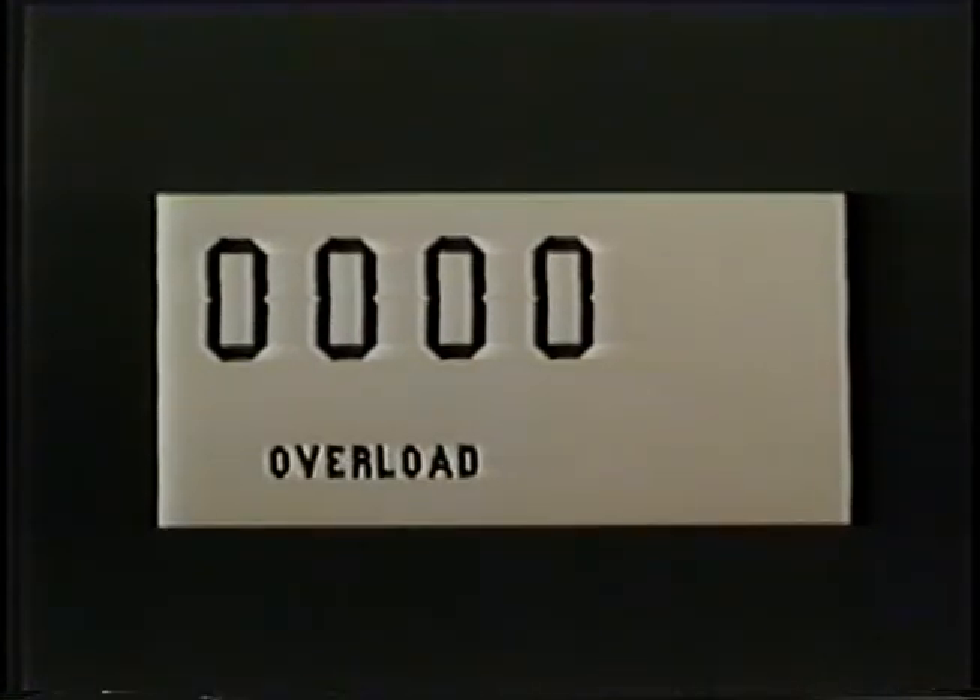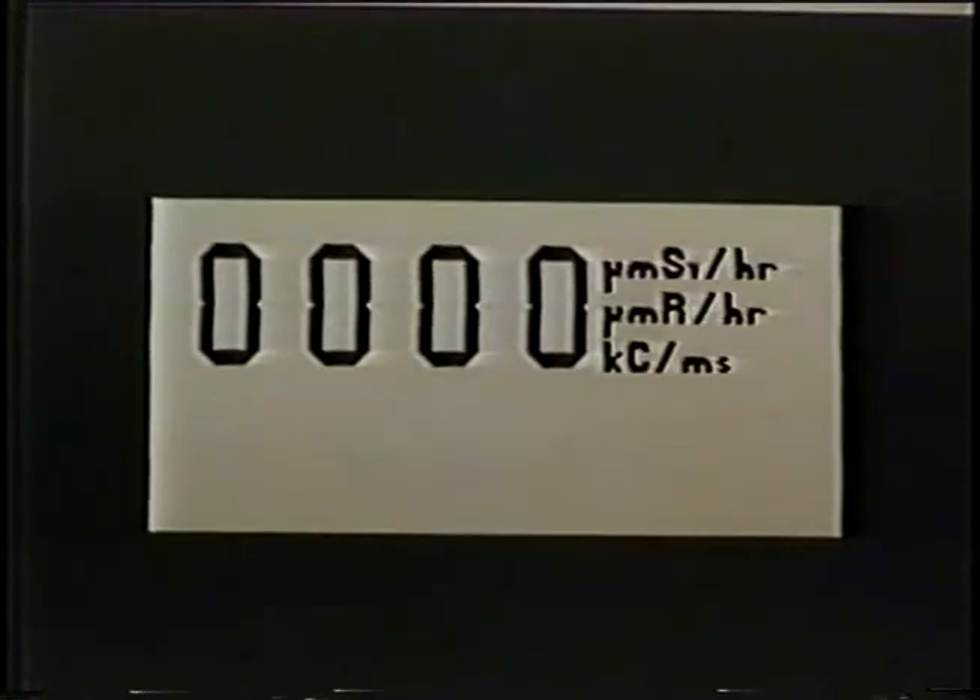The word OVERLOAD will illuminate if the detector being used is exposed to radiation intensity greater than the detector's maximum operating limit. The word COUNTING will only illuminate when the instrument is in scalar mode and the start push button is depressed and released. When the battery power is low, the battery symbol will illuminate. The instrument calibration will change less than 3% from full battery power to low battery indicator. Change the batteries as soon as possible after the battery symbol illuminates. The units used to show the count rate or exposure rate will be displayed next to the four main digits, and not all of these symbols will be illuminated at the same time.